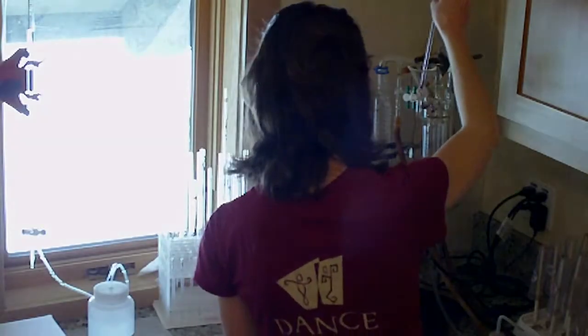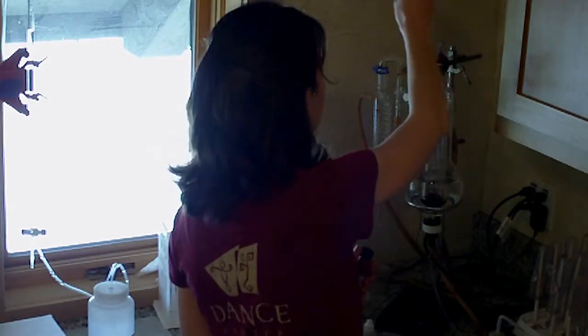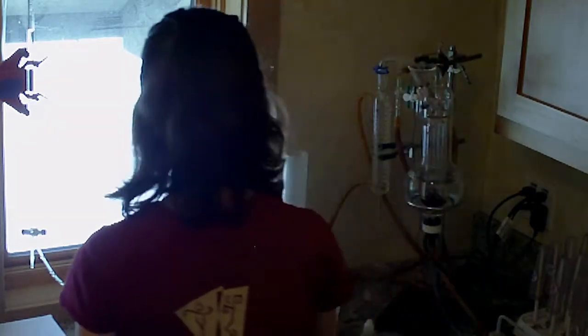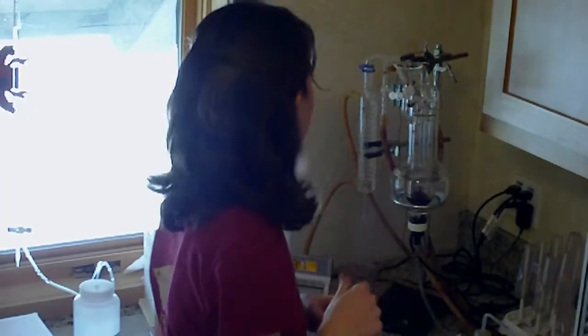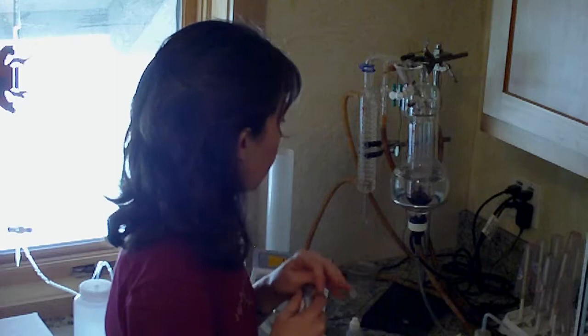So this is the volatile acidity cash still, used to measure how much bacteria we have in a 100 milliliter sample, so it's representative of what the VA might be in the barrel of wine or in a lot of wine.